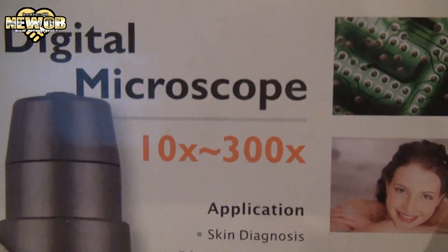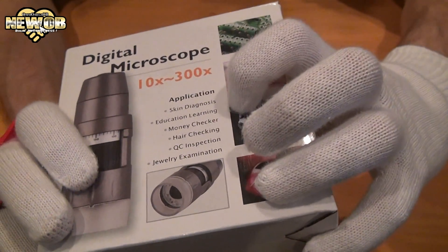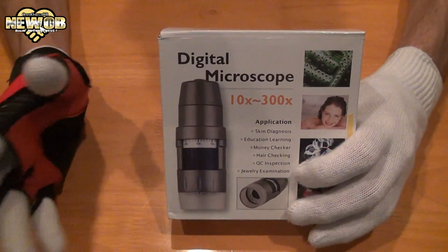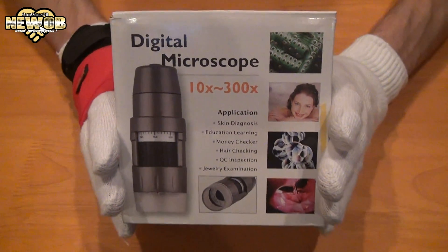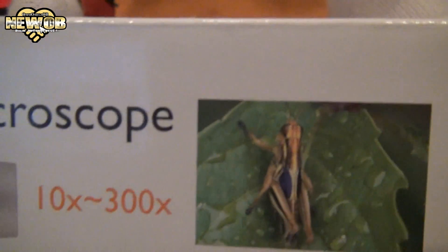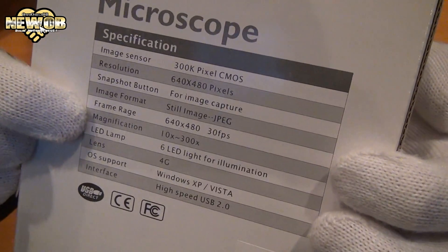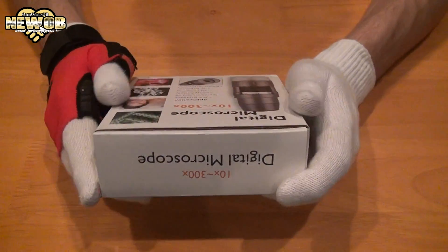This is a digital microscope — you can zoom up 10 to 300 times on your favorite object. They give examples of uses: skin diagnosis, educational learning, money checker, hair check-in, QC inspection, jewelry examination, and more. I'm going to use this to zoom in on my gloves and PlayStation Vita to see what it looks like 300 times closer. Let's take a look at the box — front, top, bottom, and sides. The resolution is 640 by 480, and it does video at 640x480 at 30 frames per second.